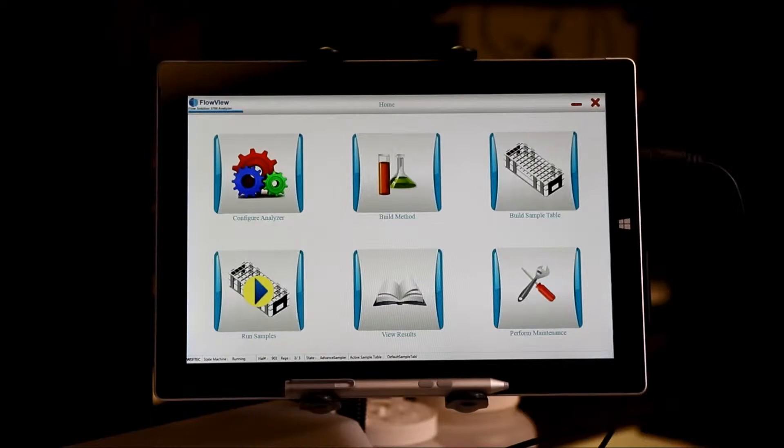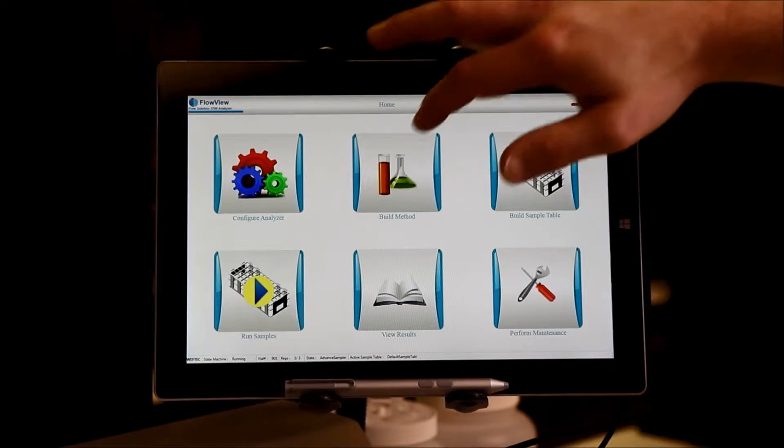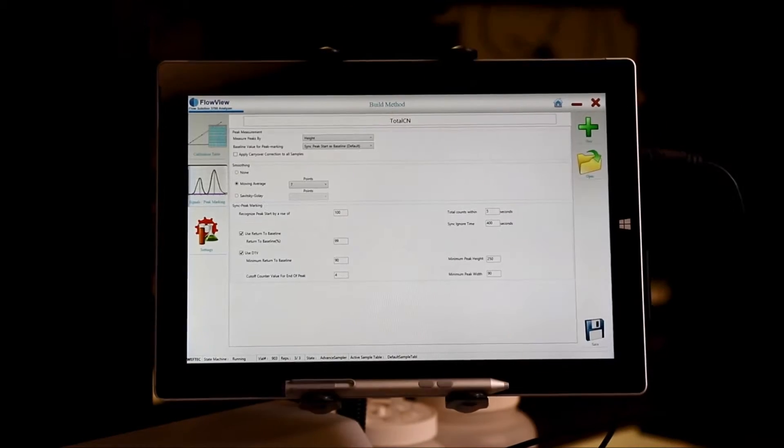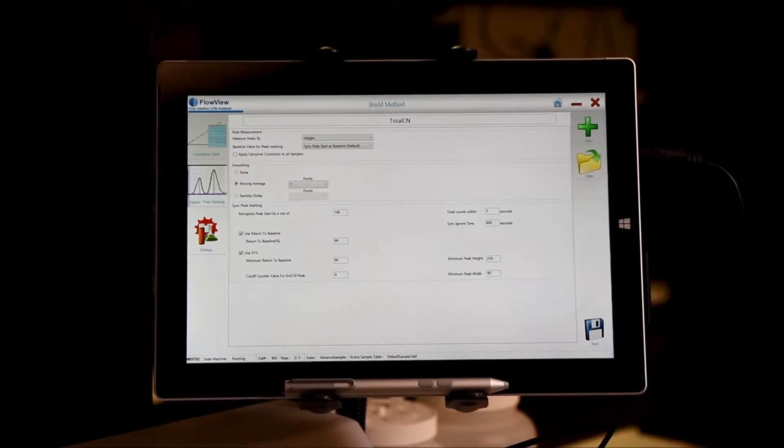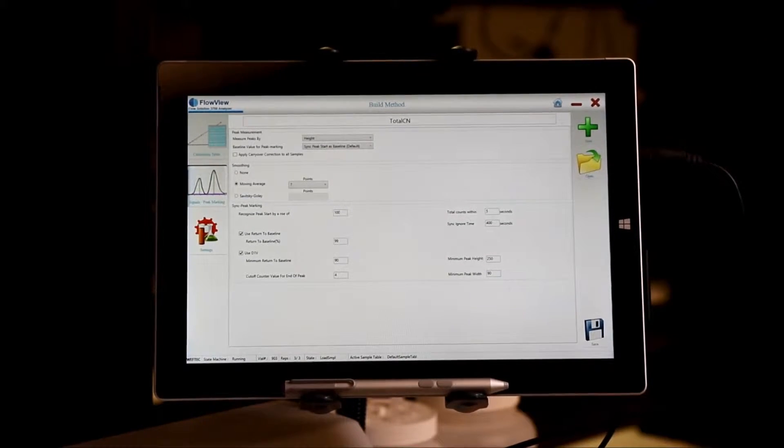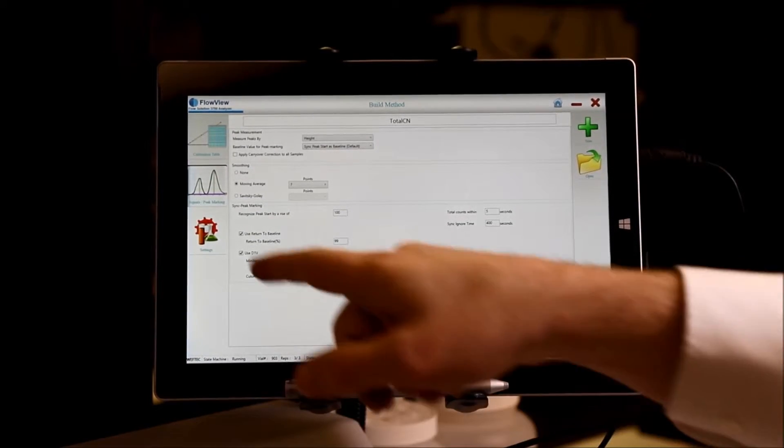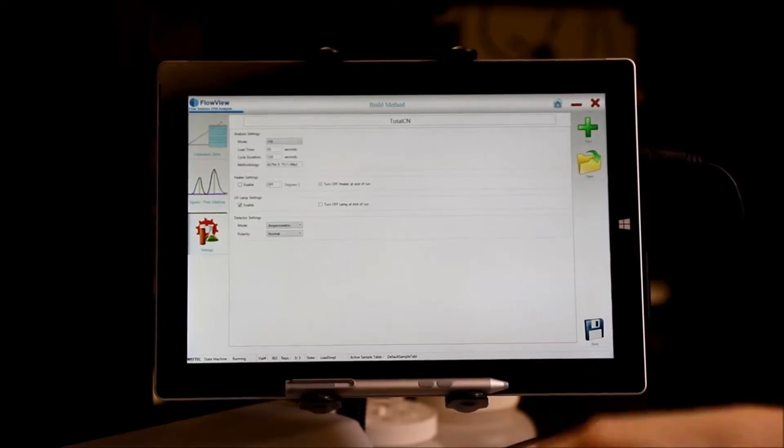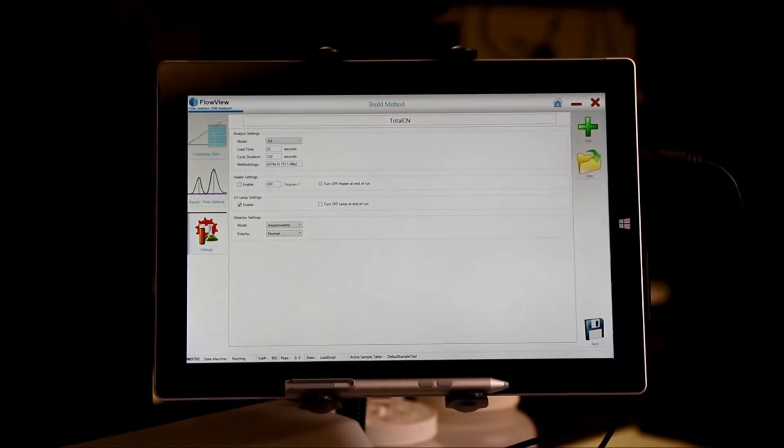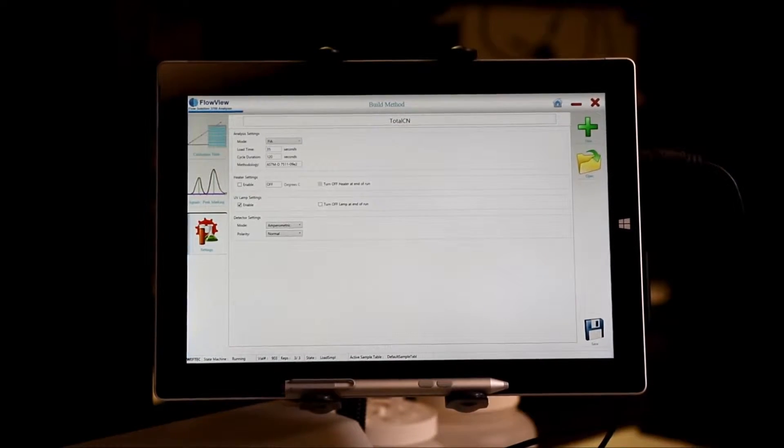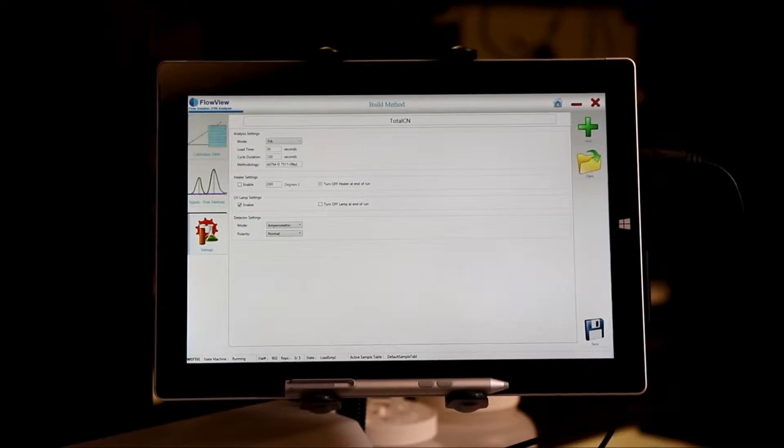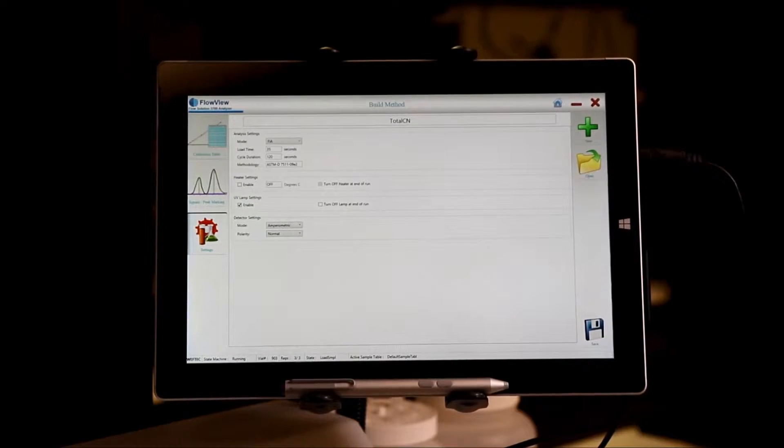The first place you start is building a method. Here you set up all of the parameters for your run including whether it's FIA or SFA, what the load time, cycle duration, heater, UV, and detector settings will be.